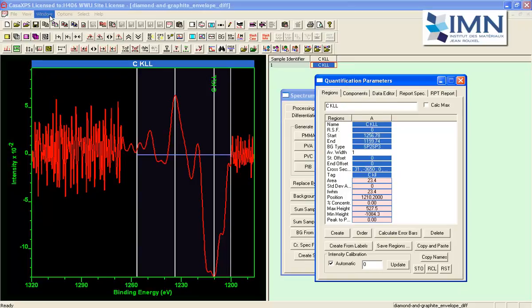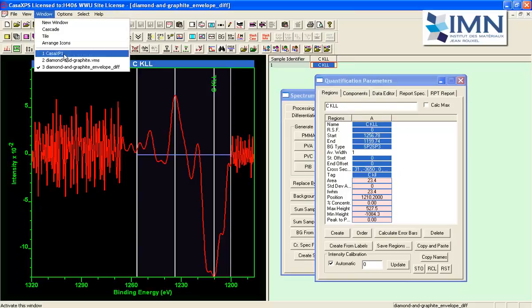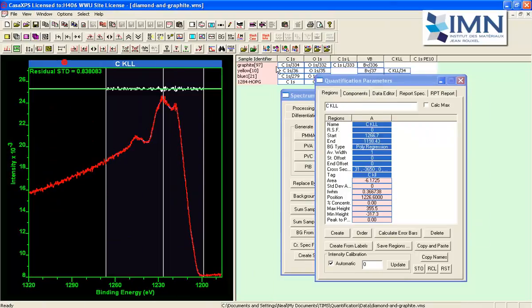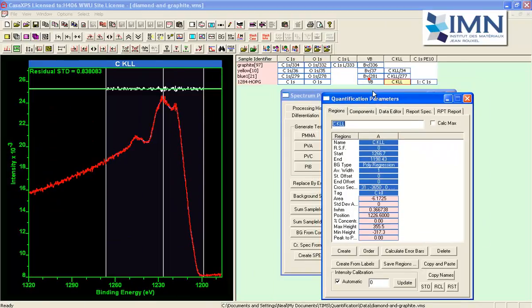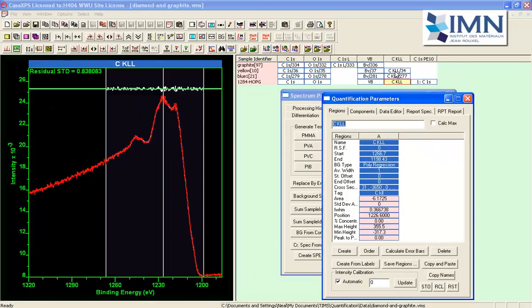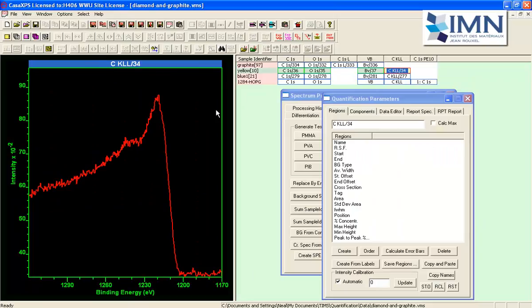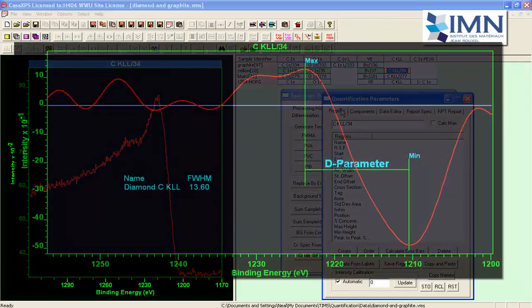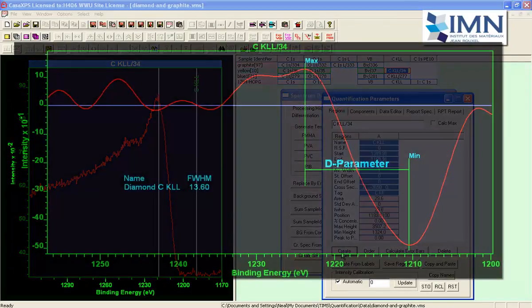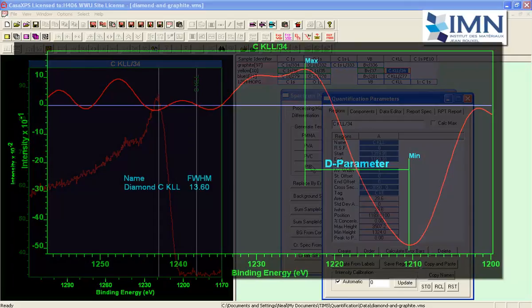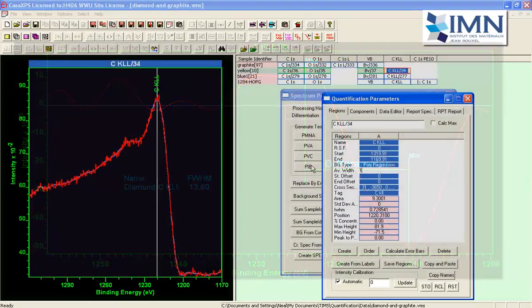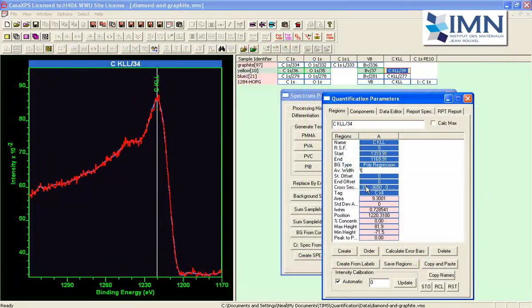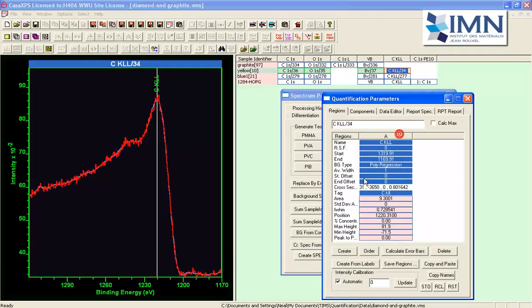We can go back and look at a diamond rather than the graphite. So this will do the same exercise again we will create a polynomial regression type.